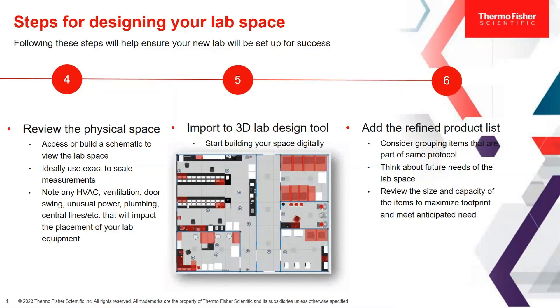I'm going to go to the video to walk through — and I'll voice over this video as well. Essentially, you're going to start with building the infrastructure of the lab: the walls, the doors. Then you're going to add the bench work, the casework, and some of the cabinets, maybe desks. And then you're going to add the products that you've chosen from your product list. Let's skip over to the video and have a look at how that's done.